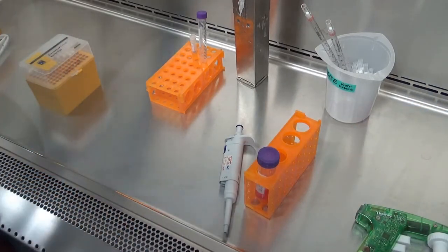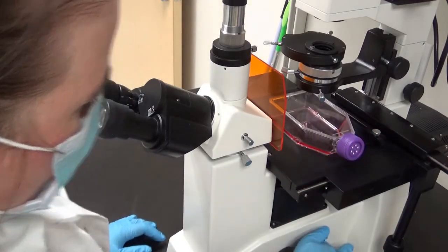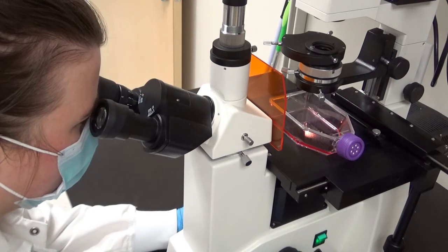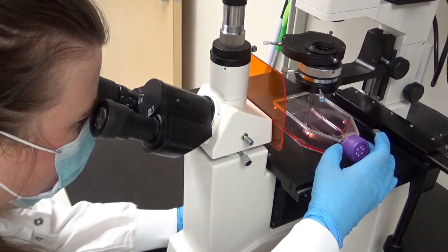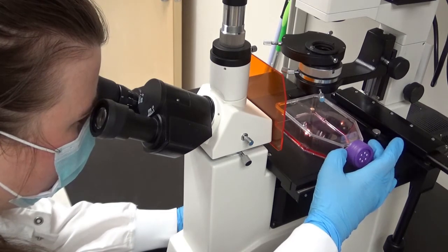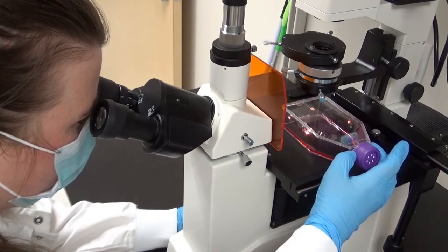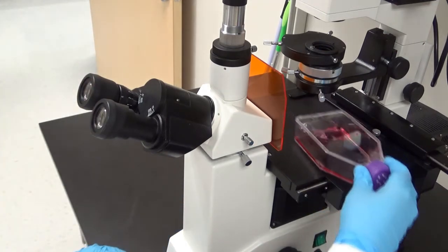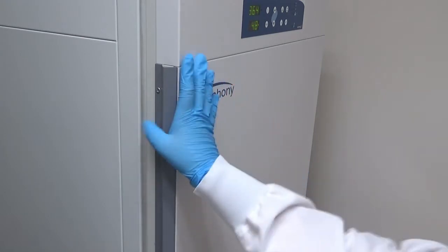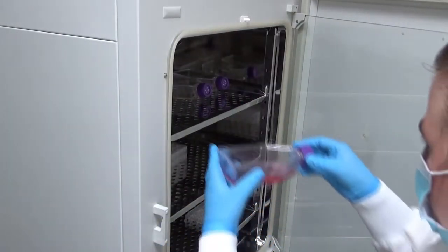Move the flask to the microscope and view the cells to ensure they are present at the intended density and homogeneity. Check multiple areas of the flask. Move the flask carefully to the incubator. Culture time and conditions will vary based on cell type.